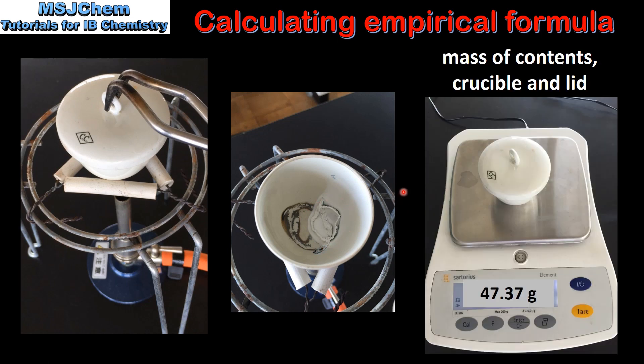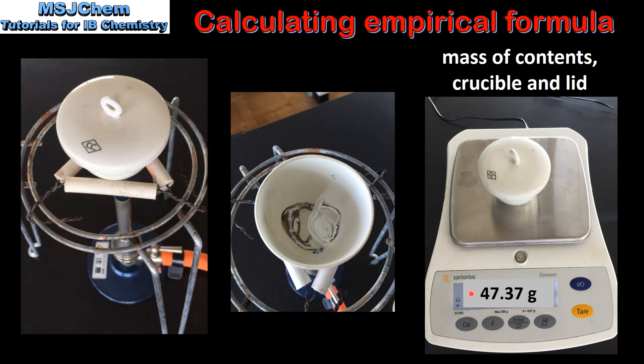When the crucible has cooled, the mass of the contents, crucible, and lid is recorded. As you can see, the mass has increased as the magnesium has reacted with the oxygen in the air.